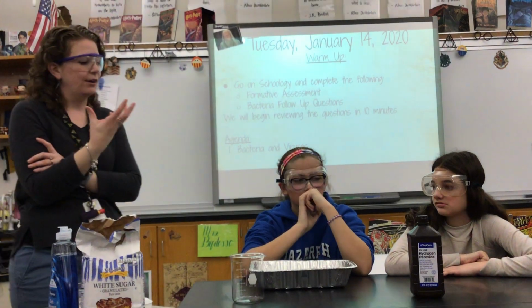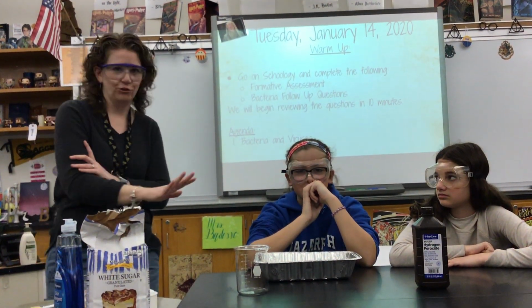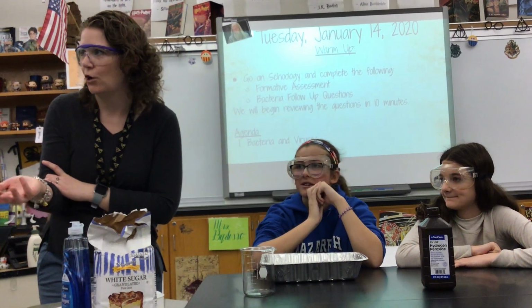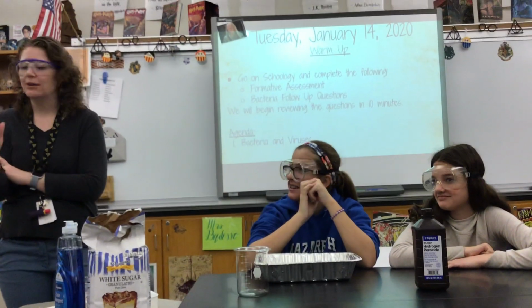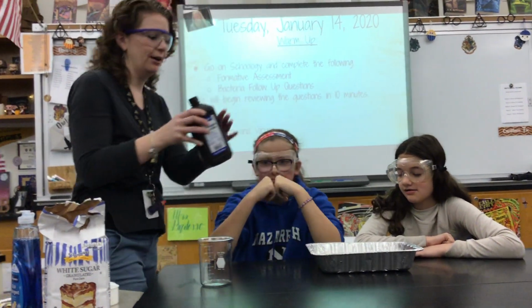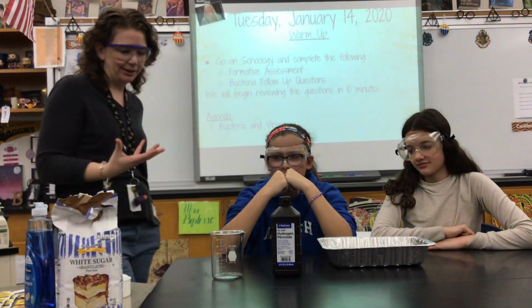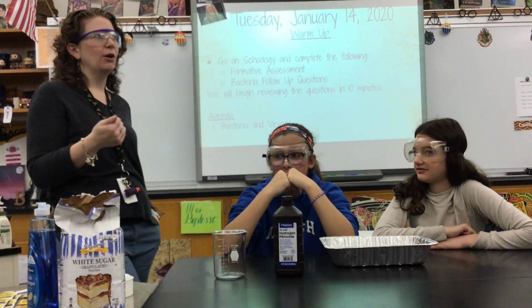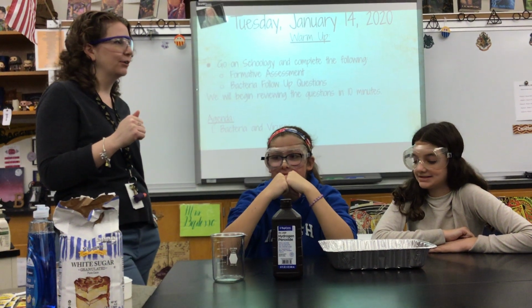So what we're going to do is a very small version, okay? So don't get overexcited. We're not flooding Mrs. Badesso's room with foam, okay? We're going to do a very small version of the catalytic decomposition of hydrogen peroxide. And the catalyst, who remembers what a catalyst is? I said it this morning, you were all paying such good attention to Eagle Vision. I'm so proud of you.